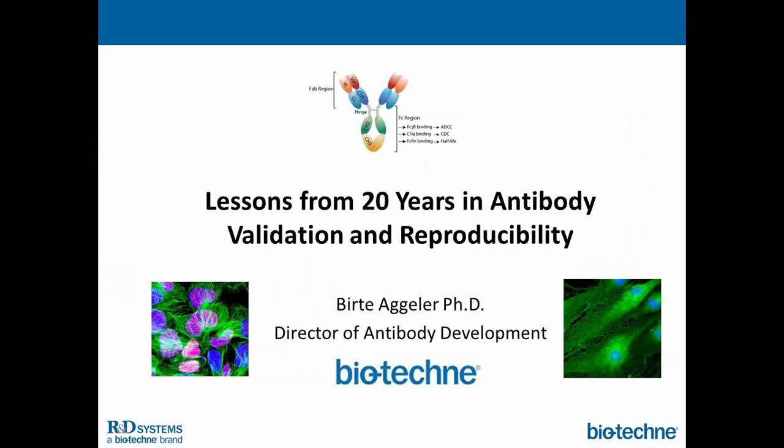Sometimes we see antibodies work beautifully in ICC, and they will not either recognize anything in IHC, or they will give you a very high background. So it's really not necessarily predictable.